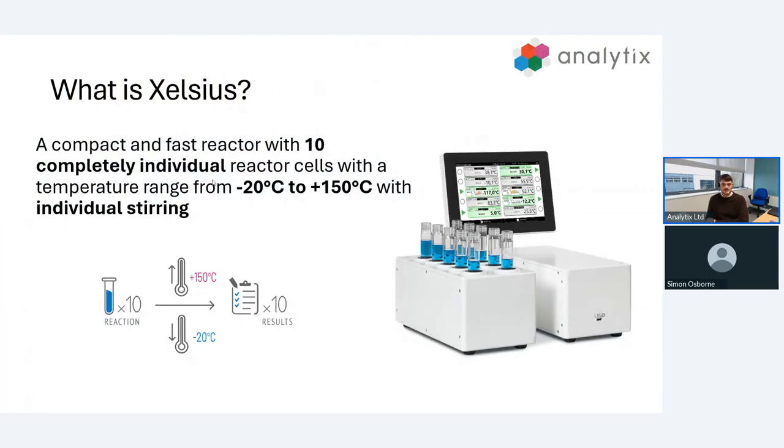What is Excelsis? Excelsis is a 10 position reaction station capable of independent temperature control in all 10 positions. We have a huge temperature range from minus 20 all the way to 150, and with independent control we can have one vial at minus 10 and the other at 140 with no problems. We also have independent stirring in all 10 vials. At its heart, Excelsis is a 10 in 1 reactor capable of replacing 10 heating cells, mantels, cooling baths, stirrers, all in one compact solution.